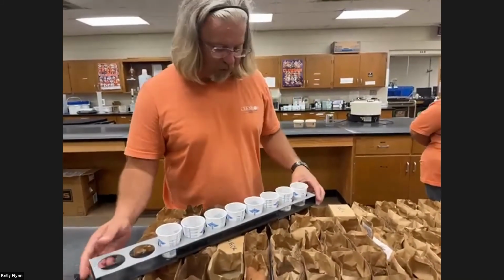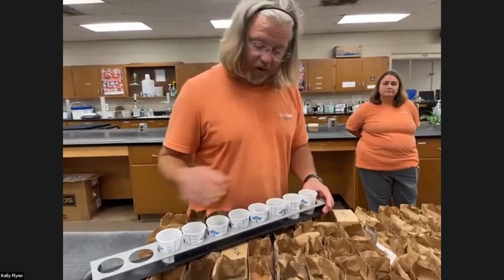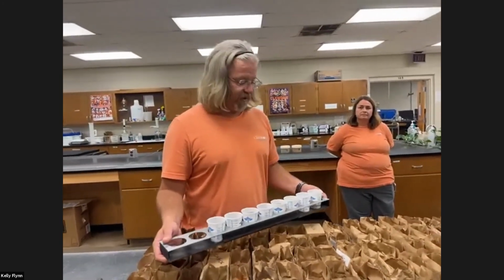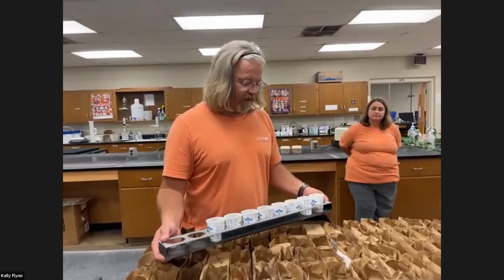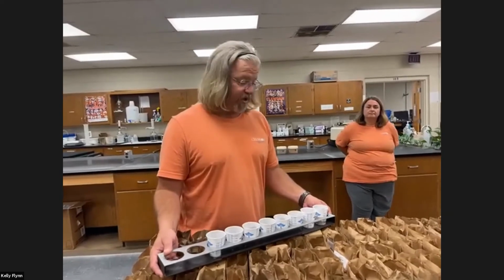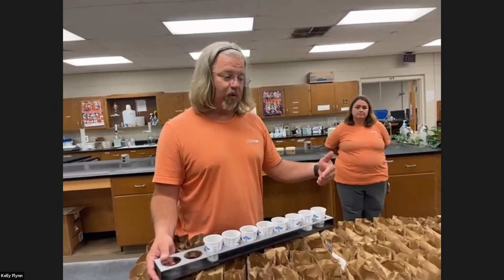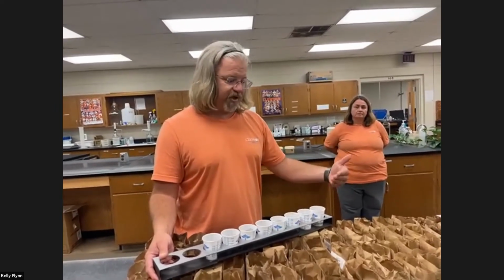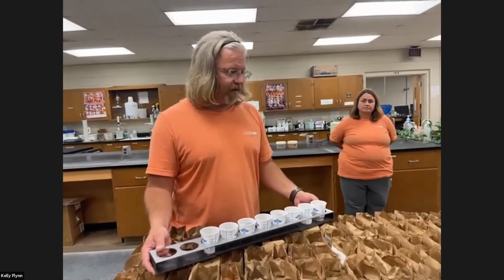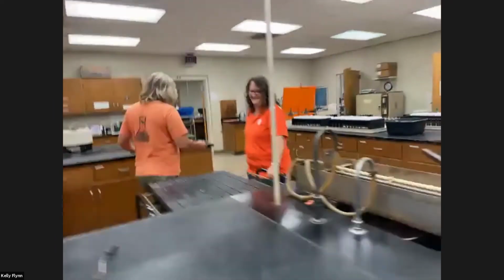Once the soil is in the medicine cup, we have an automatic dispenser that will add 15 mils of water. And after we add the water, it needs to sit for approximately 30 minutes. And then they go on to a robotic platform where we have pH probes. We have our pH standard of 7 and a pH standard of 4, where we calibrate the machine before each and every run. These go in sets of 100, and then I can show you the machine. It's actually running right now.